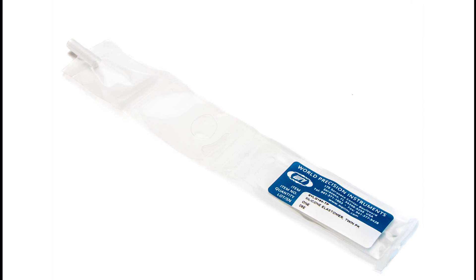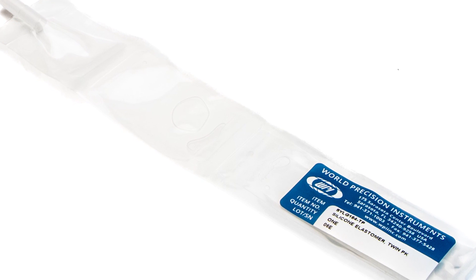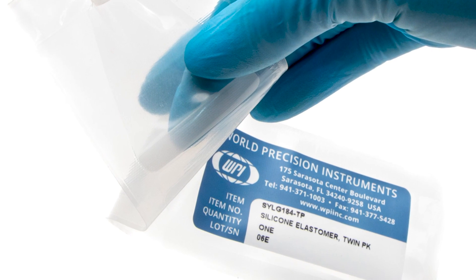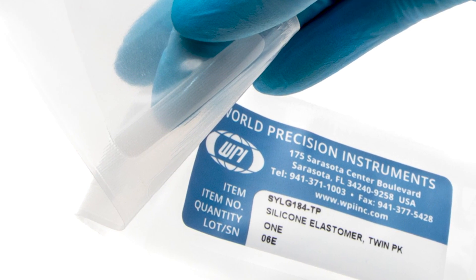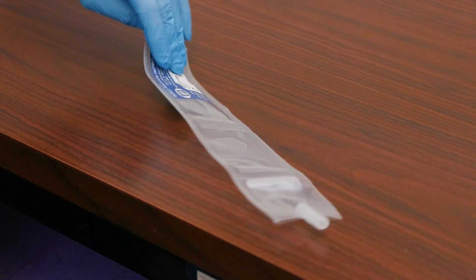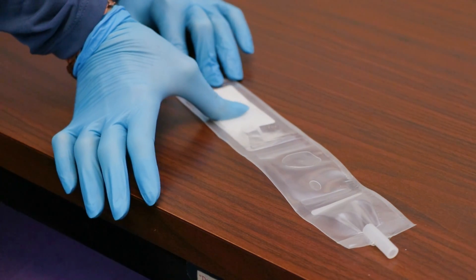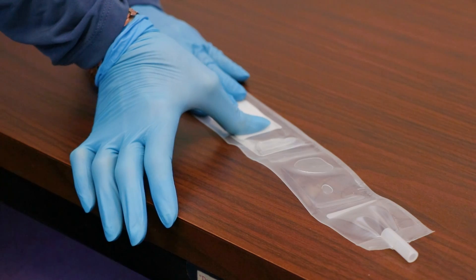Silgard is a two-part silicon elastomer with a very low dielectric constant, which makes it ideal for patch clamping and many other lab applications, especially in electrophysiology. The twin pack is a convenient single-use sleeve containing both parts of the adhesive. We will show you how to properly mix the Silgard twin pack.